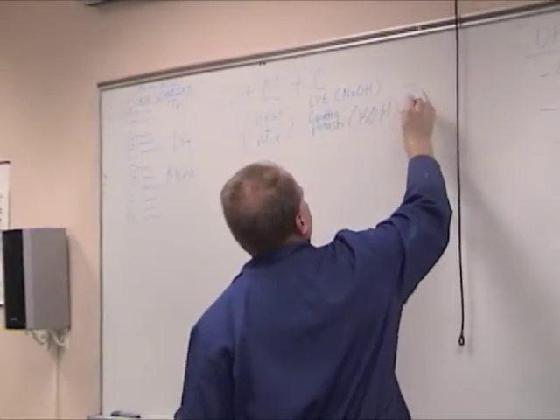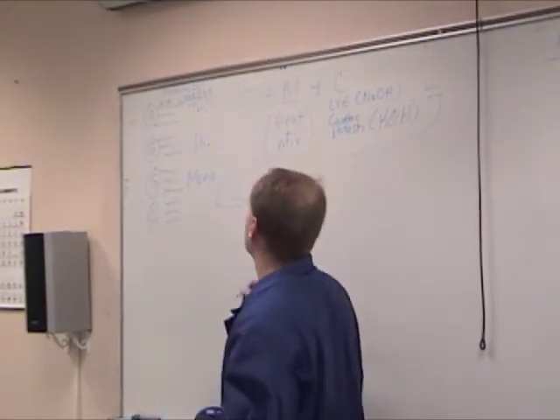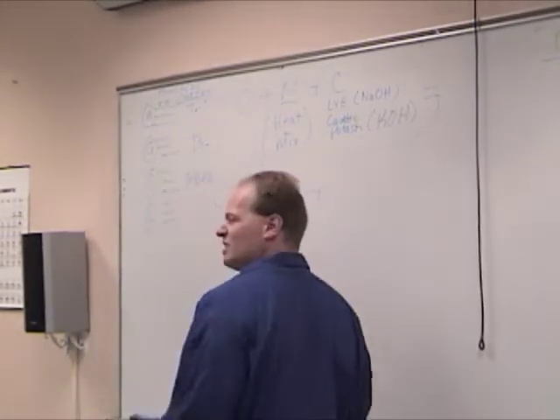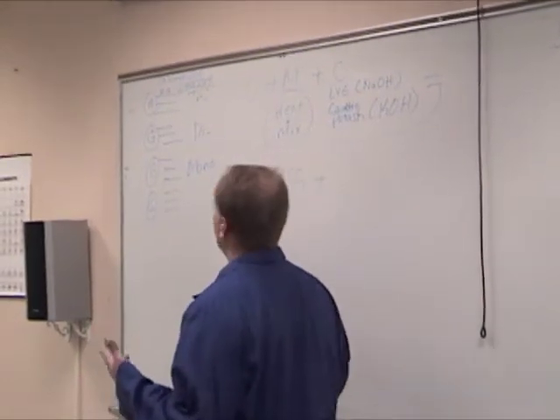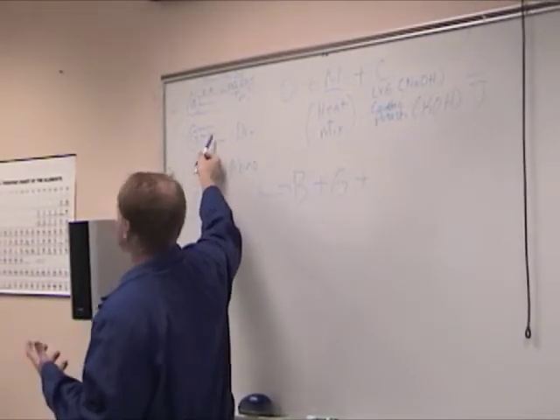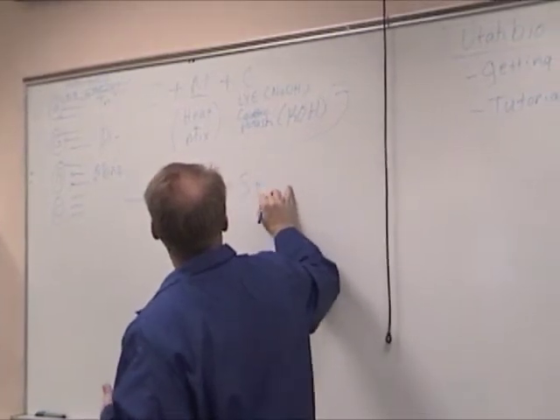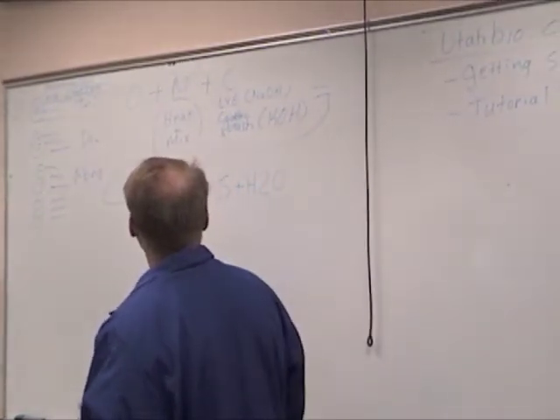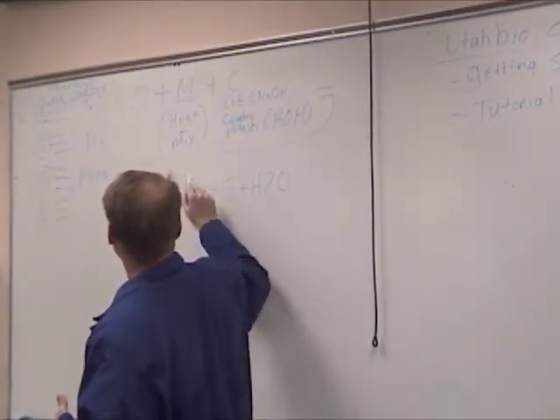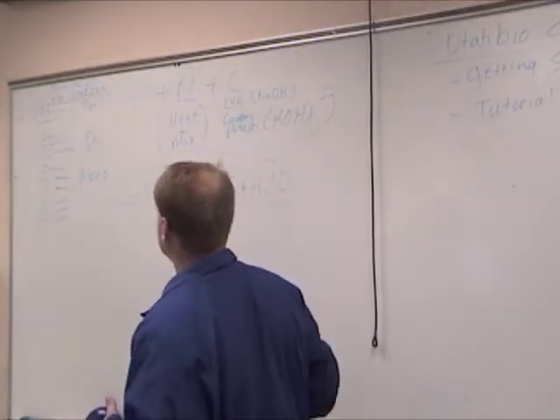On the other side, what I'm going to get, hopefully, if everything goes well, is biodiesel, some glycerin, and always a little bit of soap. There's not much we really can do about that, because no matter how hard we try, even in naturally occurring brand spanking new oils, there's still a couple of these triglycerides and free fatty acids hanging out. So there's a little bit of soap. We're also going to get a little bit of water. Okay? Your goal is to get as much of this as possible. This we really can't control because it's just going to happen, but as little of this as possible and as little of this as possible.